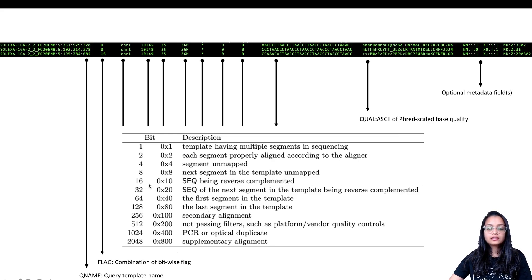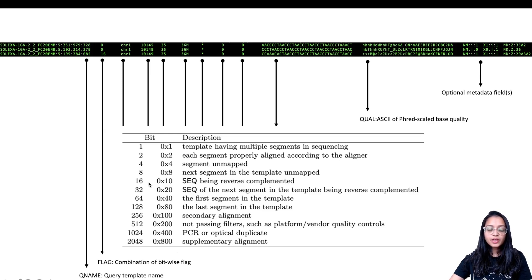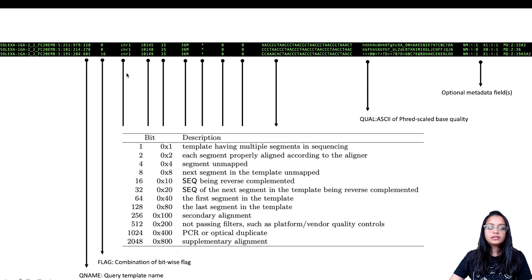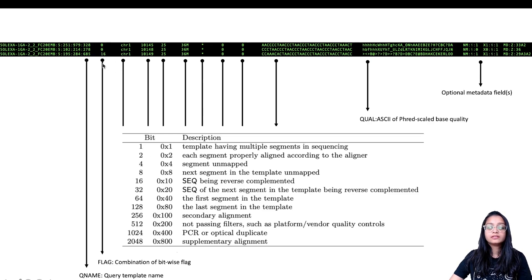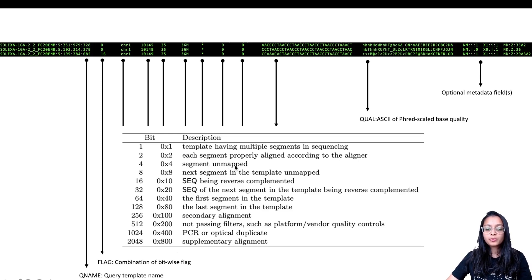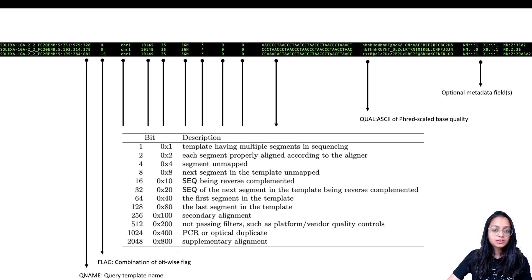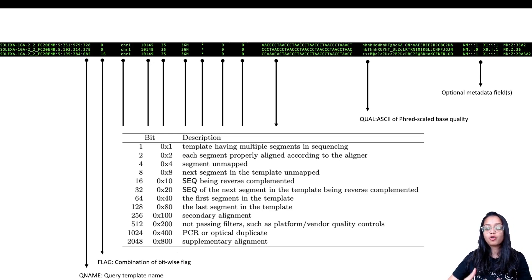We can look up the SAM flag lookup table, which maps numbers to features. For example, the third read has a SAM flag of 16, and when we look at the table, 16 corresponds to the sequence being reverse complemented. Similarly, other numbers in this field tell us whether a read is unmapped, mapped, a PCR duplicate, the first segment in the template, and so on.